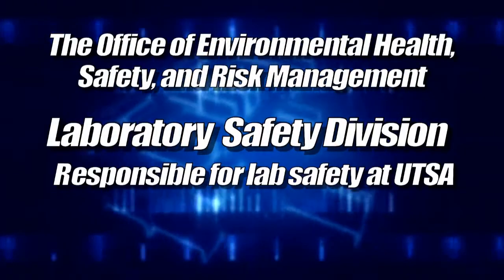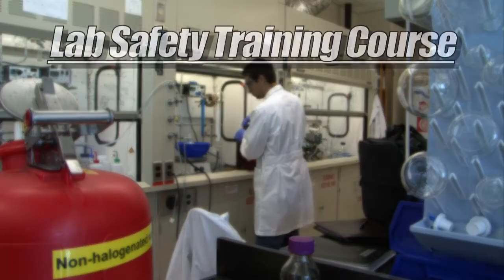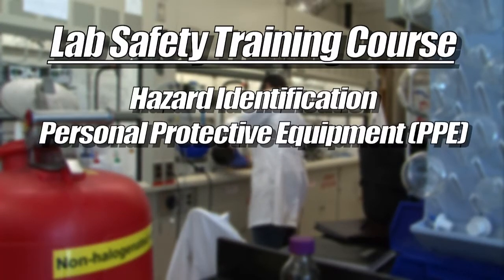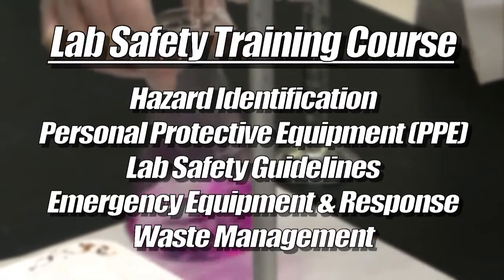My staff and I in the Laboratory Safety Division of Environmental Health, Safety, and Risk Management are concerned with the safety of students, faculty, and staff in UTSA's laboratories. Please pay close attention to the following training course. It is designed to provide you with information on hazard identification, personal protective equipment, lab safety guidelines, emergency equipment and response, and waste management.